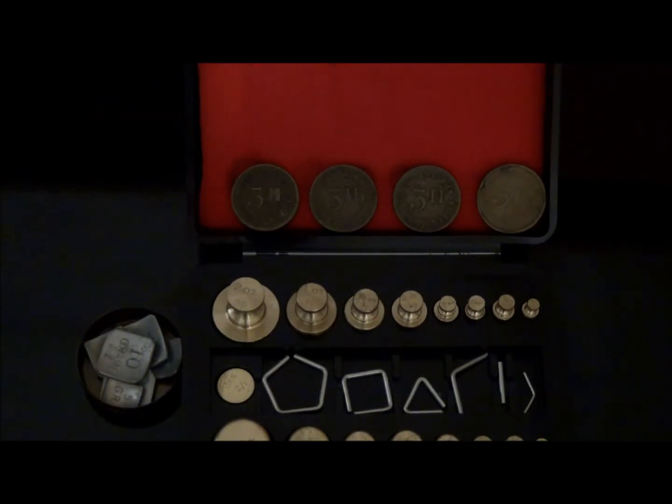In contrast, aluminum wire weights do not have this problem and are considered the best grain weights. Another advantage of wire weights is that they are shaped differently from typical cylindrical weights and are therefore easily distinguished from other weight forms, preventing mix-ups.